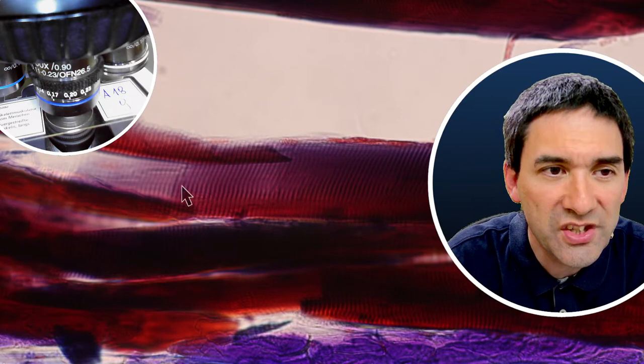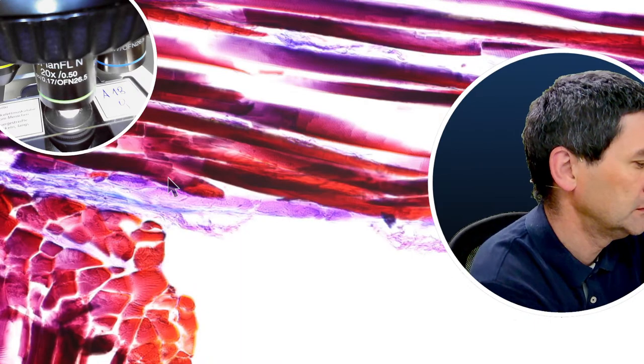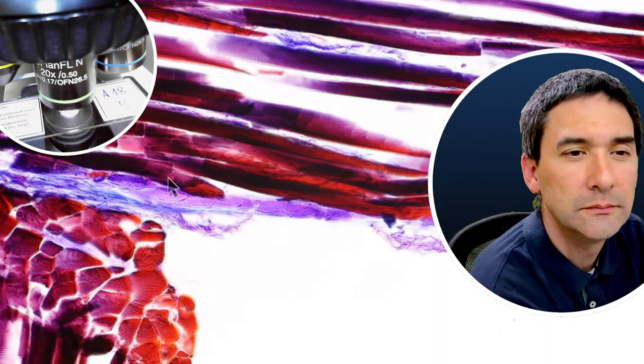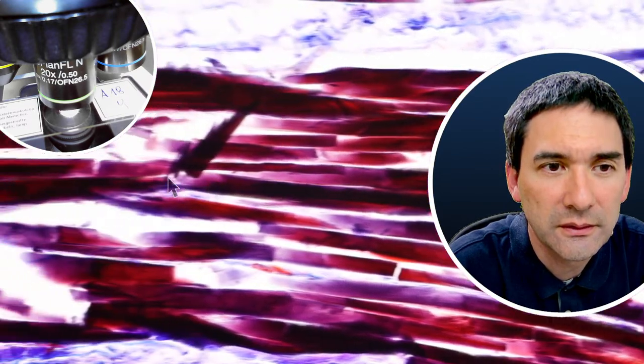Occasionally there have been certain places where we could actually see the individual nuclei as well. Depends a little bit. But again, here you can see quite nicely the so-called striations, the light and the dark bands. Let's go down a little bit with the magnification again. Here, depending on longitudinal or cross section. So you see the typical structure of a skeletal muscle of a human being.